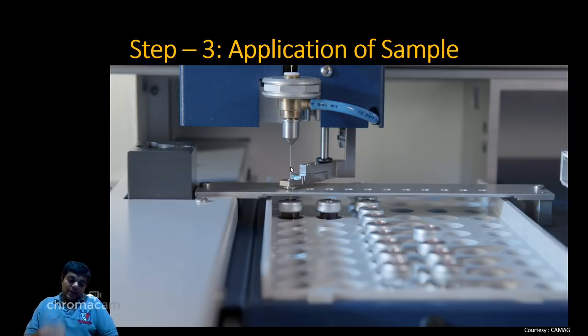You see, when you are collecting the sample, it is loading, and when you apply it on the stationary phase, it will be injecting. Why did I do it like this? This is the surface and you are going to apply it like this. You will see just now. And one more thing, why I have paused the video, I'll tell you. If you go back to that comparison slide, I had asked you to swap those points. And after swapping, on TLC you have a round spot. Over here you will see a rectangular spot of your sample. Keep your eyes concentrated on the plate.